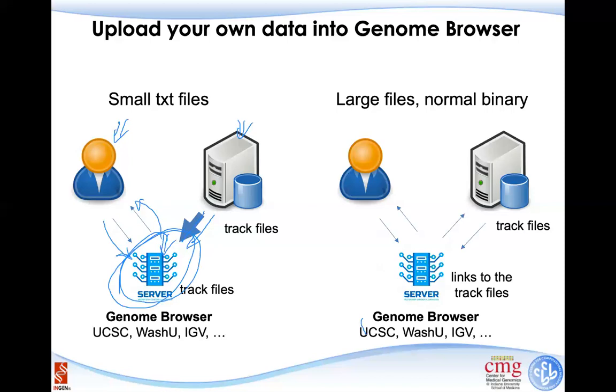So later on, after next generation sequencing became more and more popular, they started to use a different way, which is the primary way we deal with data these days. On the right side, you can see how most people do this.